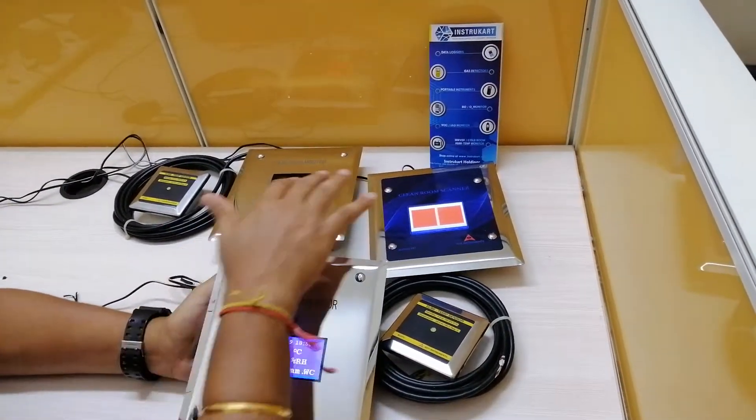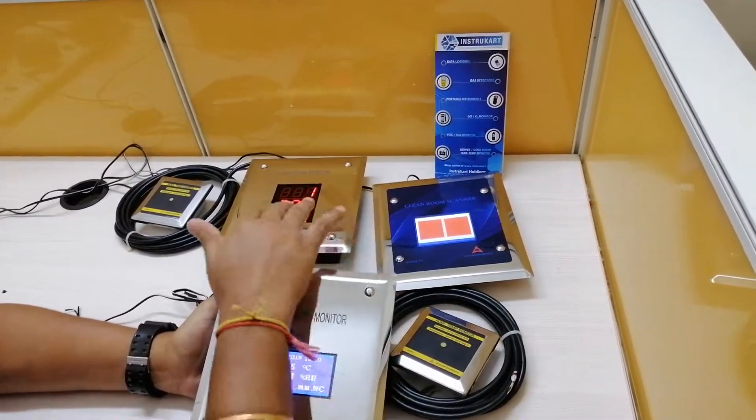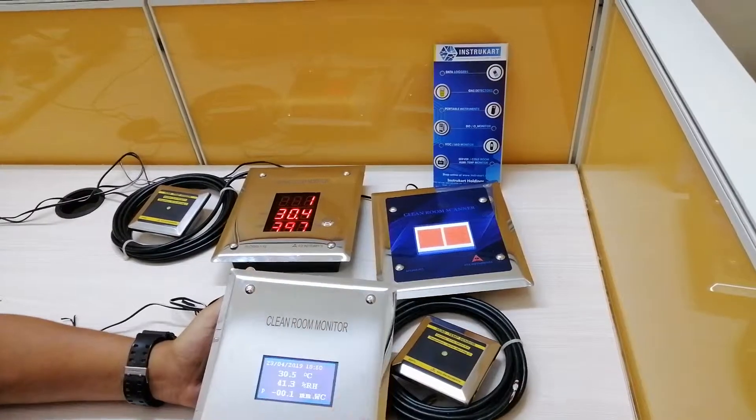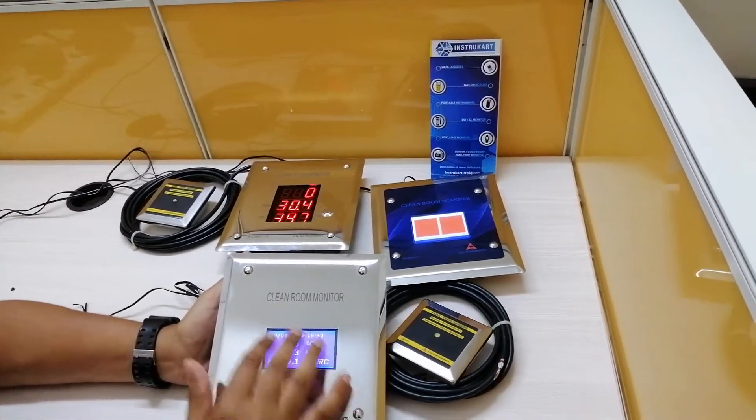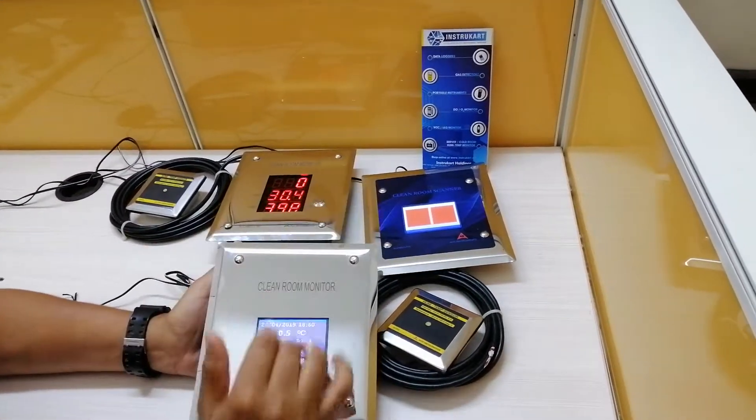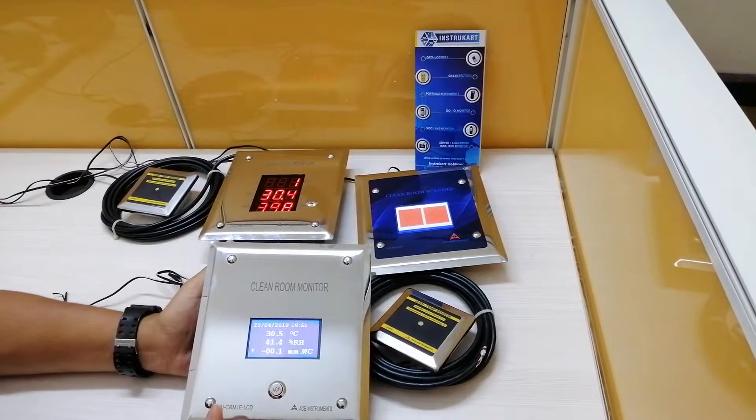The same functionalities are applicable for all these instruments. Only the screen changes in each instrument.